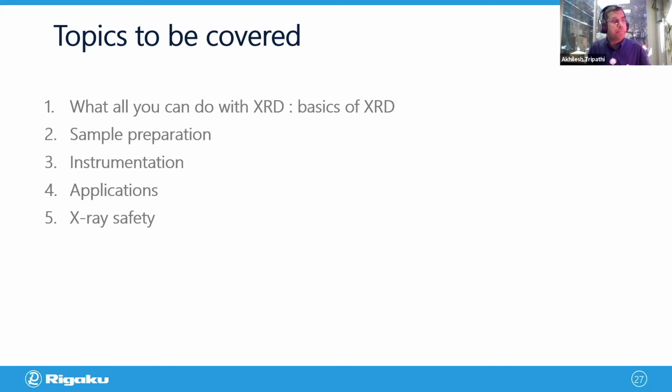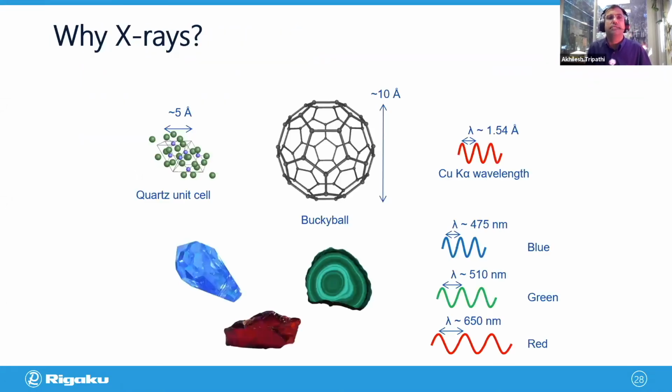Sample preparation, though very simple, but we will talk about what one should not do and what one should do for the sample. A little bit insight into the instrumentation, application, and finally a slide or two for X-ray safety in light of all these instruments.